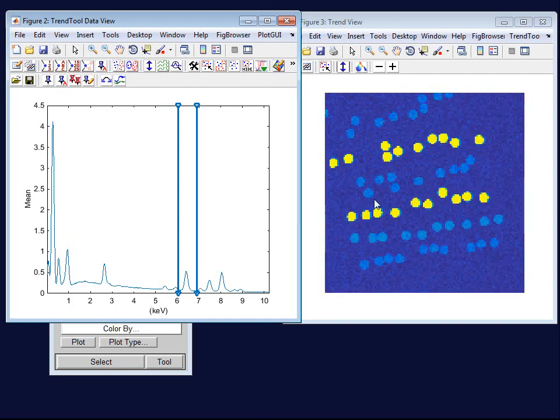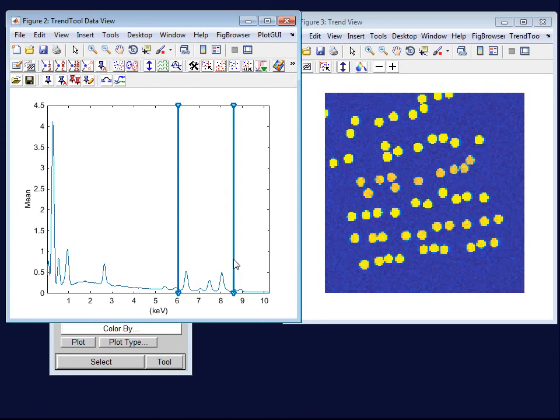So now we're viewing just the integrated intensity between my 2 markers. And if I drag that open, you can see that, for instance, integrating across all 4 of those peaks gives me a very even view of almost all of my wires over here.